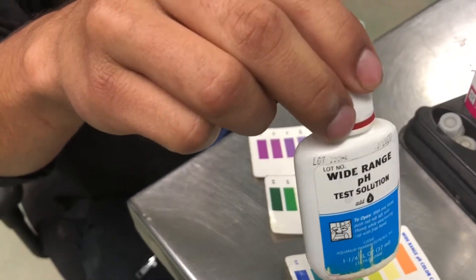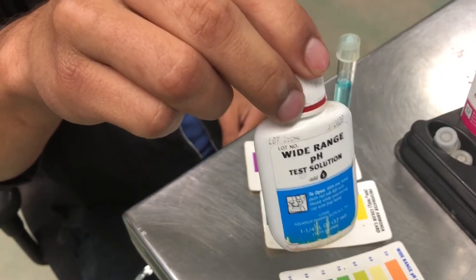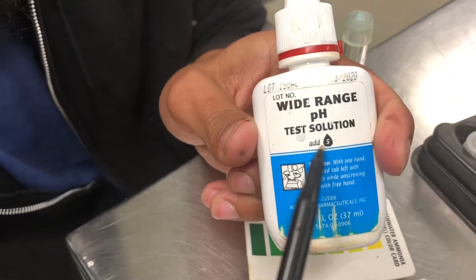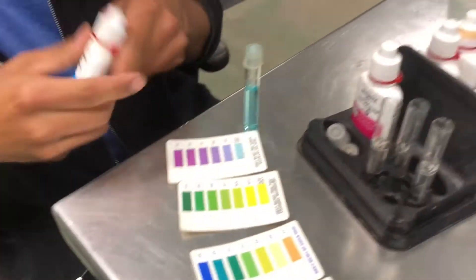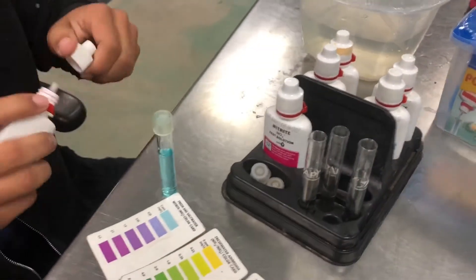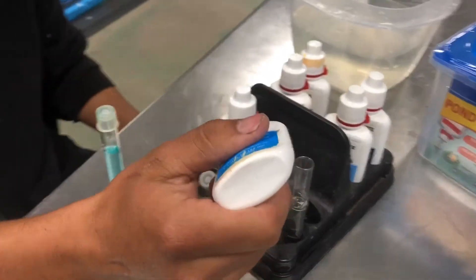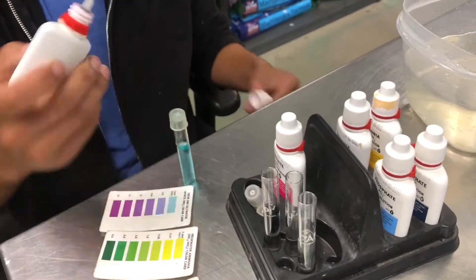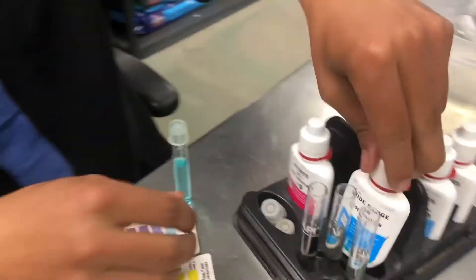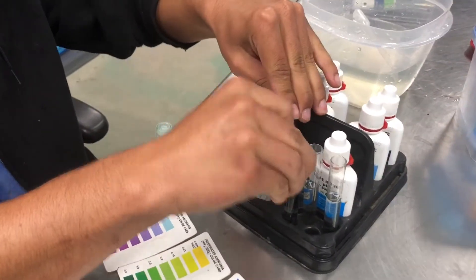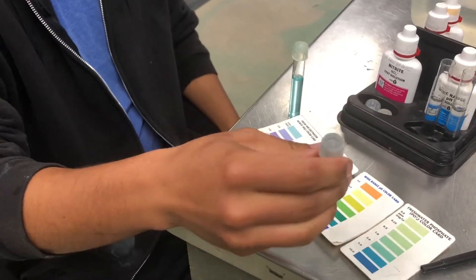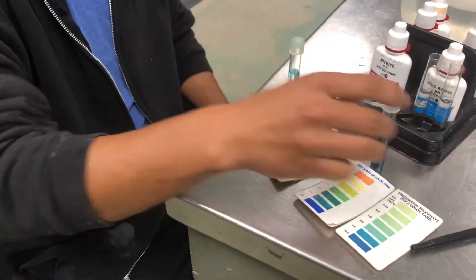The next one is the pH. And this one also says add five drops. So, same thing. Same thing, put the cap on, give it a good shake. Go ahead and set it next to your card.